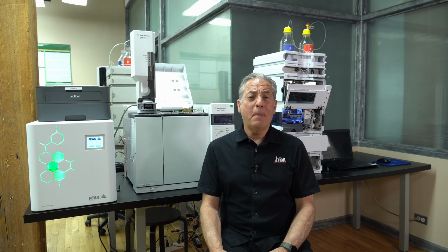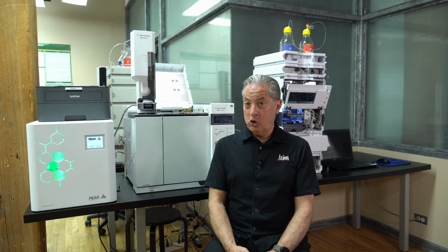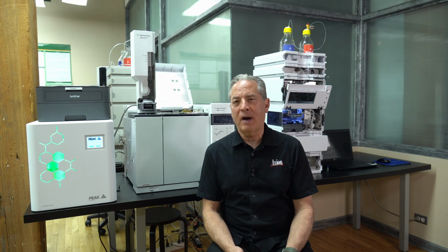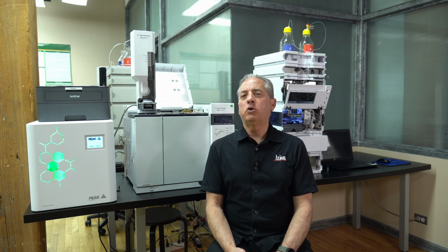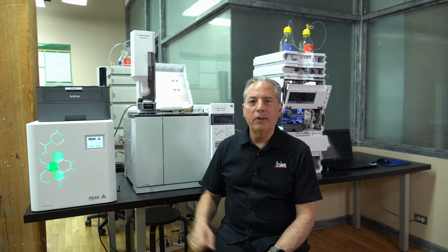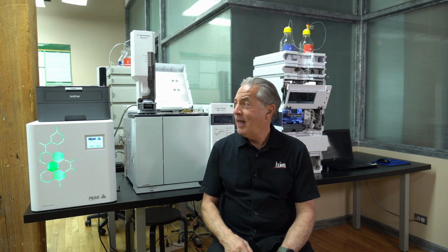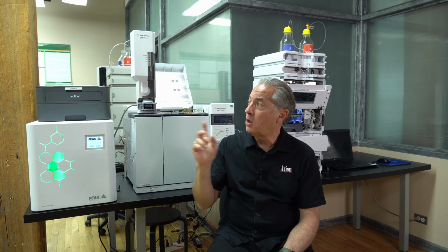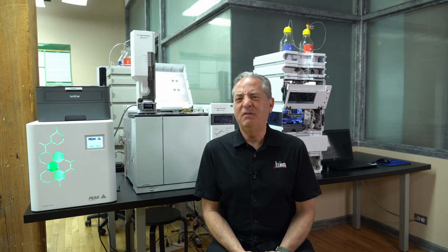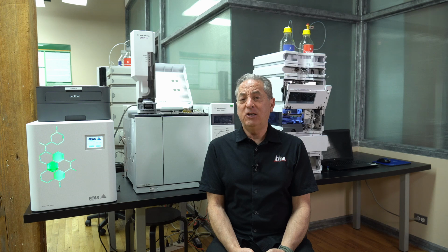So my big thing in my lab is I've really tried to get away from cylinders. So we've gone to a zero air generator. It works off a compressor, so we don't have to worry about pulling bottles in and out. We've gone to a hydrogen generator. In fact, I've got one sitting here right next to me. We love the hydrogen generator. Pour water in the back and get pure hydrogen out the front, and there's no storage and no high pressure issues. I've got one hydrogen generator that generates fuel to all 12 GCs. So easy to work with, easy to get rid of that set of dangers. So that would be my thing that I would focus on in the GC lab.